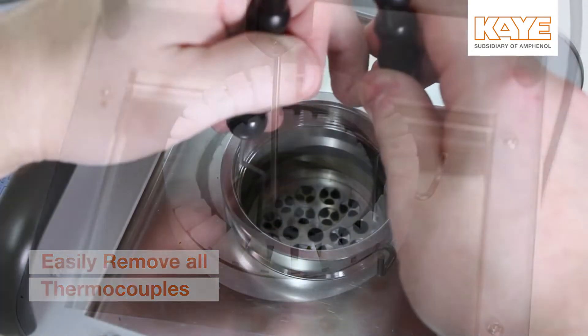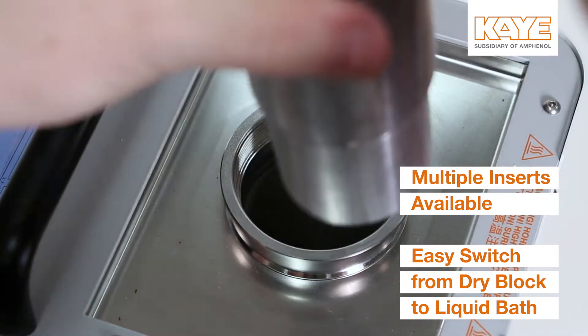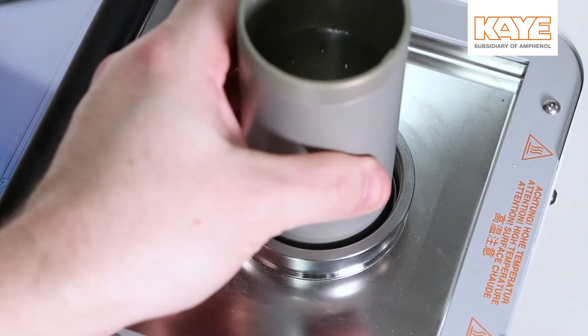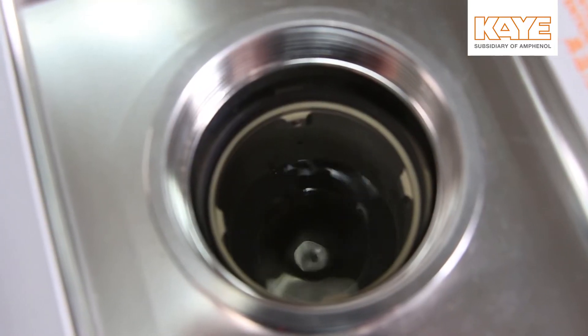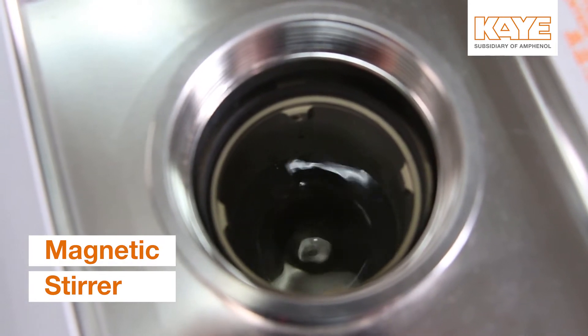To convert the LTR-150 from a dry block to a liquid bath, simply remove the dry block and insert the liquid tub. The tub insert also includes a magnetic stirrer to maximize stability and uniformity.